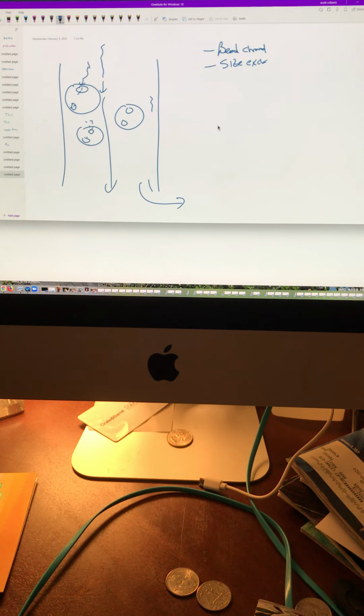So the bottom line is this. In bead chromatography, what is eluting? I know it works. I've done it, and I never took the time to do the calculations, but it works really well. The eluting is going to be a big molecule that doesn't fit. Got it? The big molecule doesn't fit.